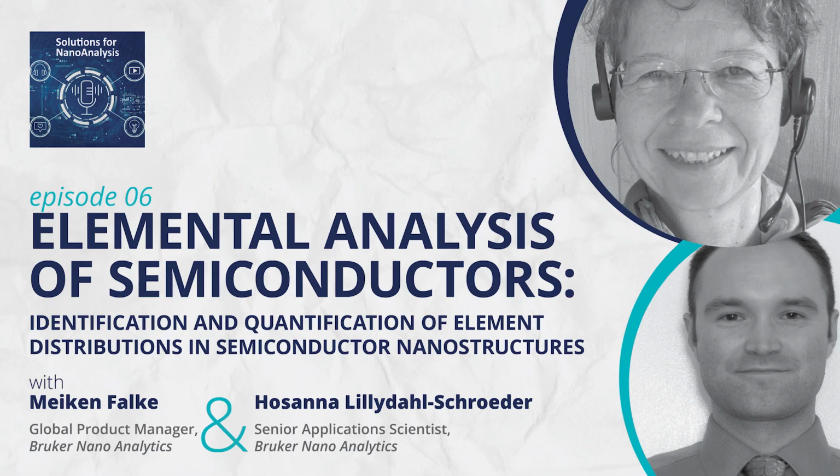One is electron beam damage. So more and more, I also see the requirement from semiconductor manufacturers to avoid beam damage and measure fast. So there we need large detectors. And being fast, having large detectors or large collection angle detectors, this invites for temporal resolution, which means in situ microscopy. So we could check the whereabouts of the elements and what they do and how they behave in changing environment in situ. Look at higher temperatures, for instance, what happens if our devices heat, if the phones become hot on an airplane, what happens and how can we avoid that?